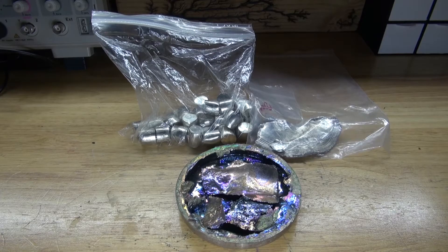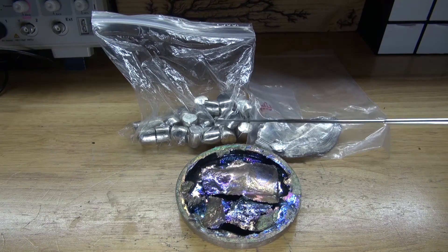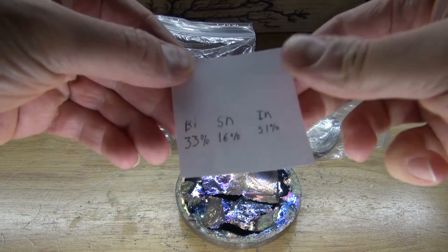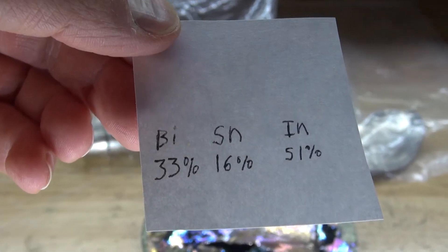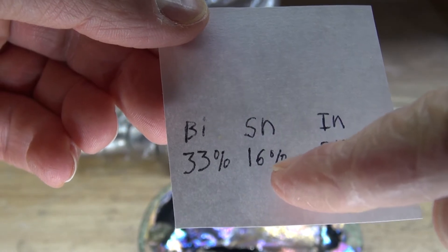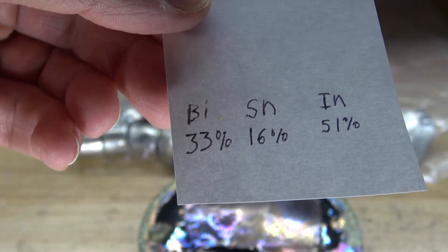These are the items you're going to need to make for this project: tin, indium, and bismuth. I wrote down the percentage of each element needed to create this eutectic alloy. What you'll need is 33% bismuth, 16% tin, and 51% indium. Combining these three elements will create Fields Metal.